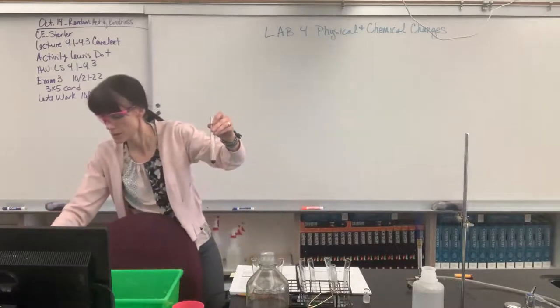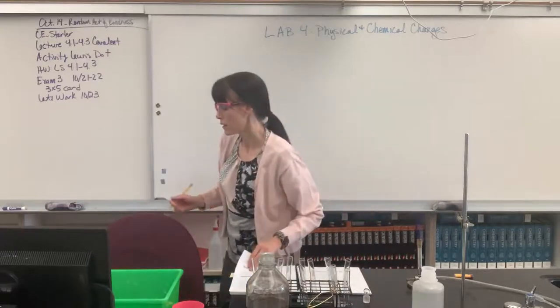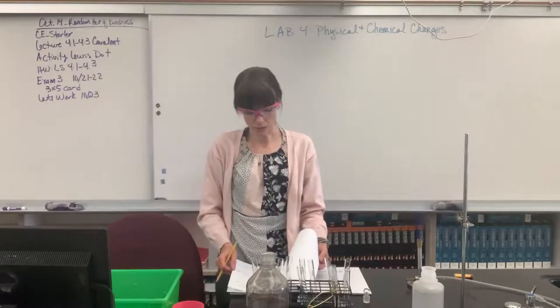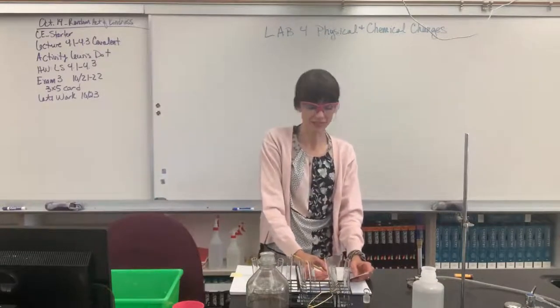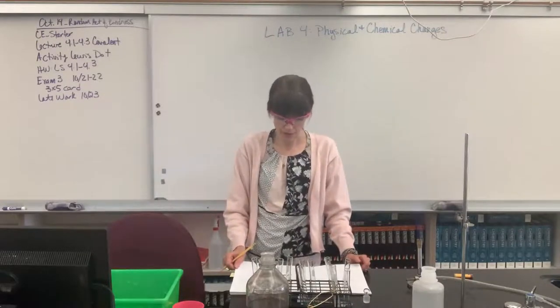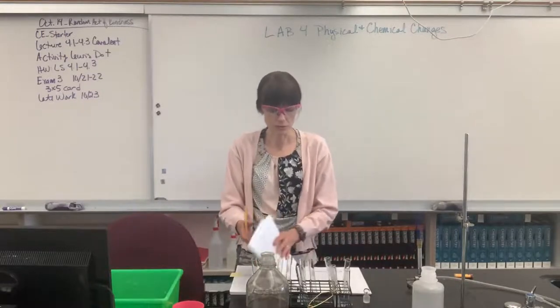Awesome. So let's go back to page 54. I'm going to write deep red. Now again, on our potassium ferrocyanide, I apologize, I don't have that. If we were to add it, it would also be a dark blue. So on page 54, where it says result of adding K4Fe(CN)6, put dark blue. Nice. Okay, good. So you should have all of table 4.1, all of table 4.3, all of table 4.5 completely done.